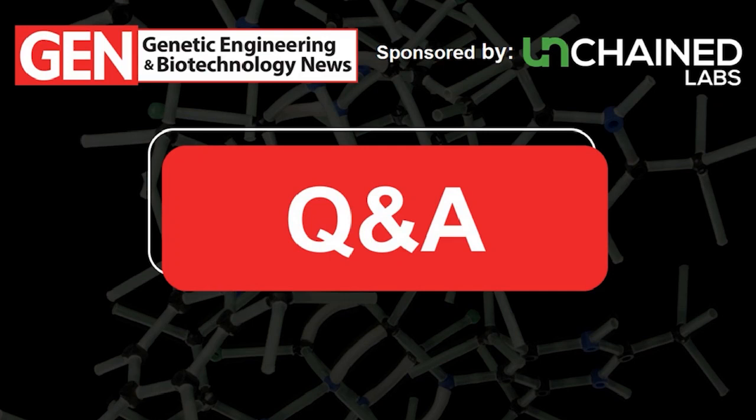All right, thank you, Kevin. Audrey, back to you. This is an interesting question. An audience member would like to know, what do you think about a consultant company's recent call for the FDA to set a % threshold of full empty in guidance documents? So I think that's an interesting question. Yes, so there has been a call to say, well, put out a number. Just put out a number that the industry could go by.